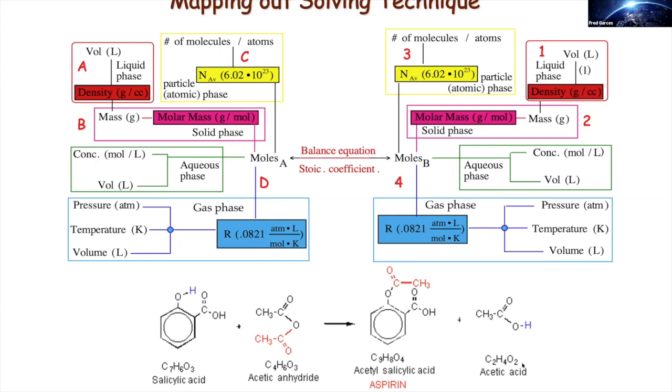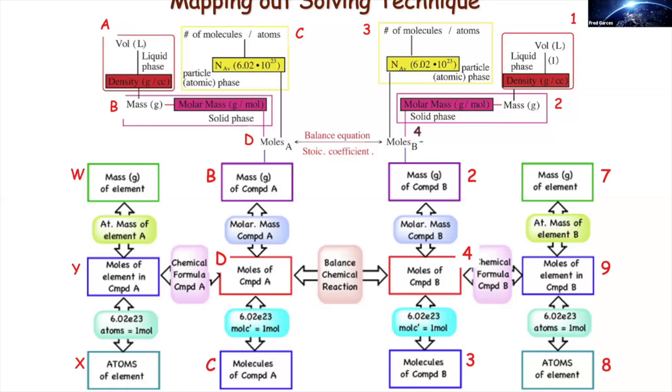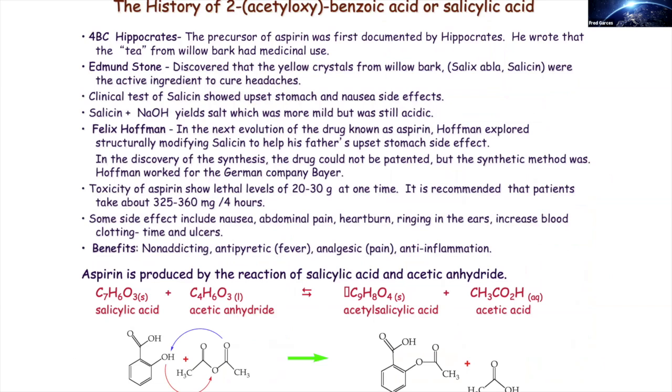Okay, here is some background information in terms of doing the calculations, because you guys are going to have to calculate the theoretical yield and then your percent yield in this particular lab based on the value that we give you. All of this, if you're in my lecture, we did in terms of stoichiometry and dimensional analysis. Here's a little background on aspirin.